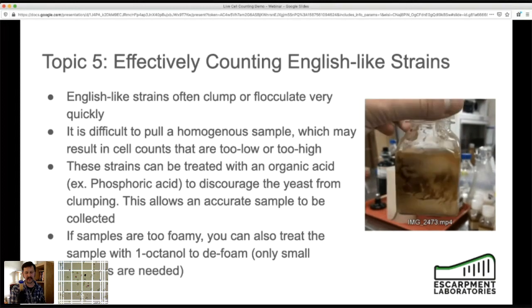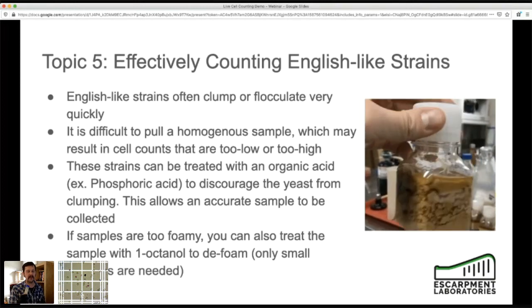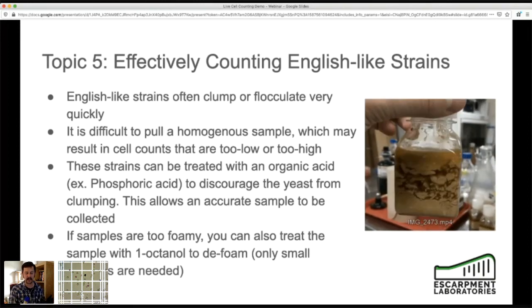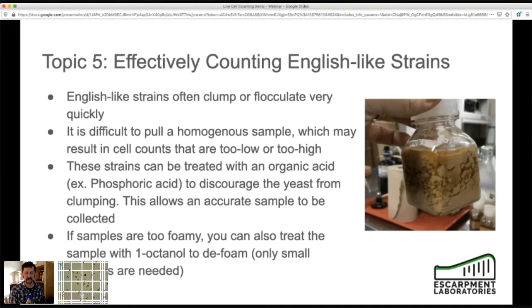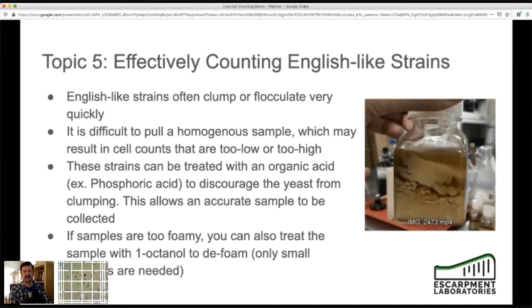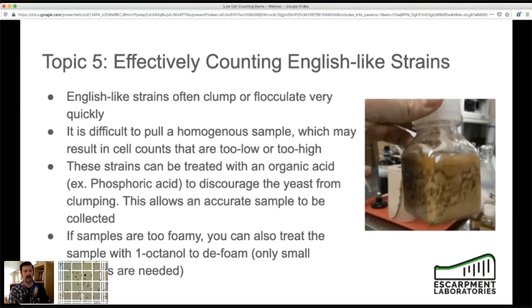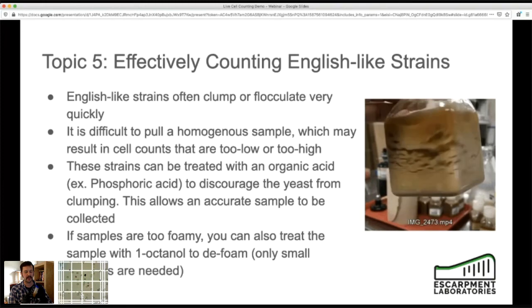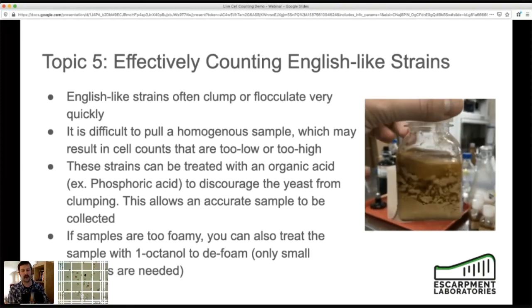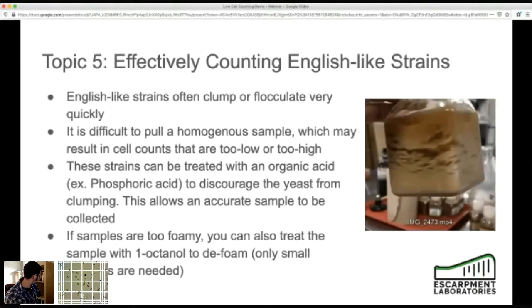When doing stuff like this, especially if you're going to be doing future cell counts or using it for QC, it's always best to pull a sample off, because this is a destructive procedure. So pull a sample off and then work with that sample you'll be destroying, so you don't compromise the integrity of the original sample. Especially true if you're going to be doing QC on it.